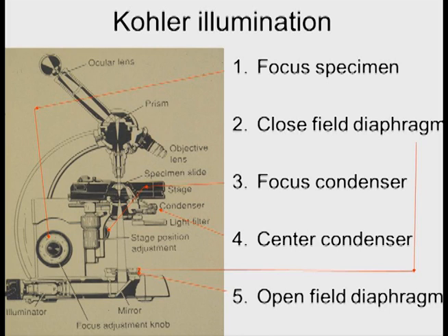Again, you focus the specimen — you put the specimen in there and observe to see it. Then you close the field diaphragm so you can see the edges of the diaphragm, to allow you to focus the condenser. You focus the condenser with a little knob. Now you might see it's a little bit off center, so you use the centering knobs around the side to center the condenser. And then finally, you open the field diaphragm right to the edge of the field of view.